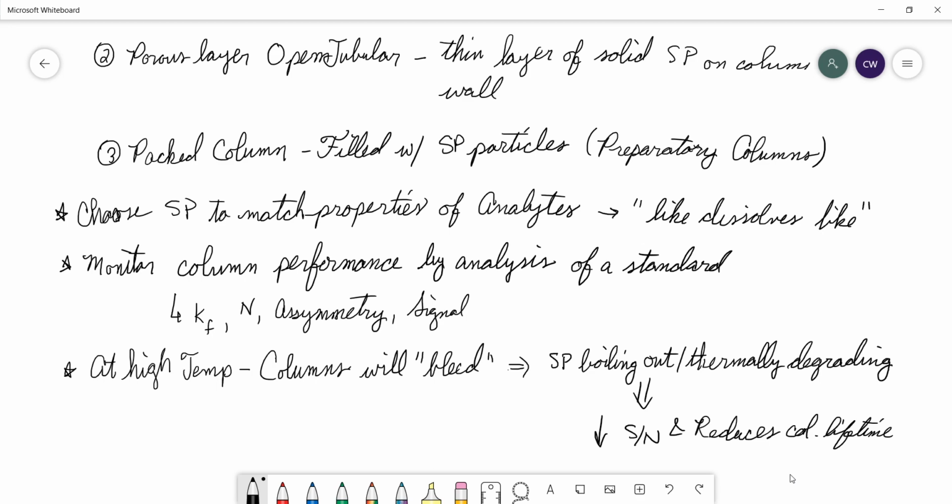So it is impossible for something to stick on a column. It doesn't do that, okay? It could be very, very sluggish. And so at higher temperatures, you will force that material out of the column because you're increasing the equilibrium rate. But you are not unsticking something because things cannot stick to a column.